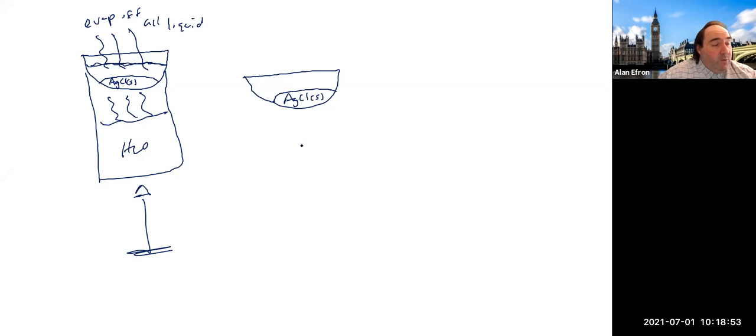We're obviously going to weigh it, and then you're going to put it back up again, and you're going to heat it for a little bit. Going to heat again until we hit, like we've talked about before, constant mass.